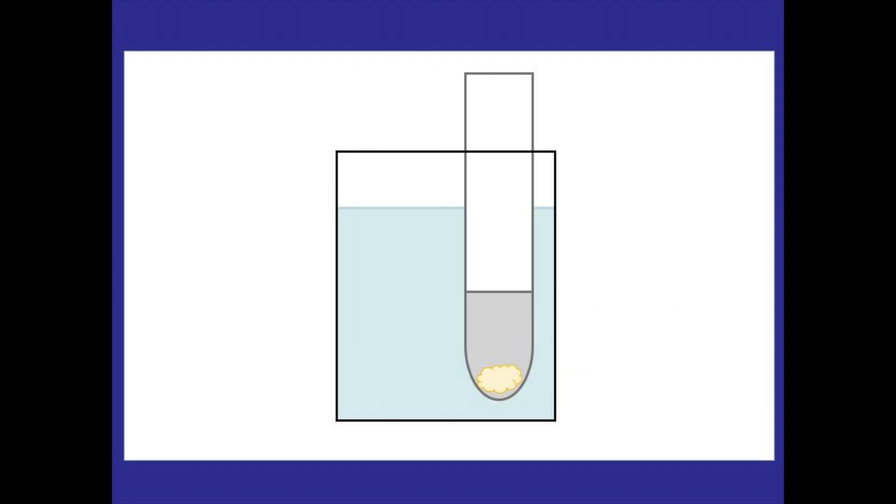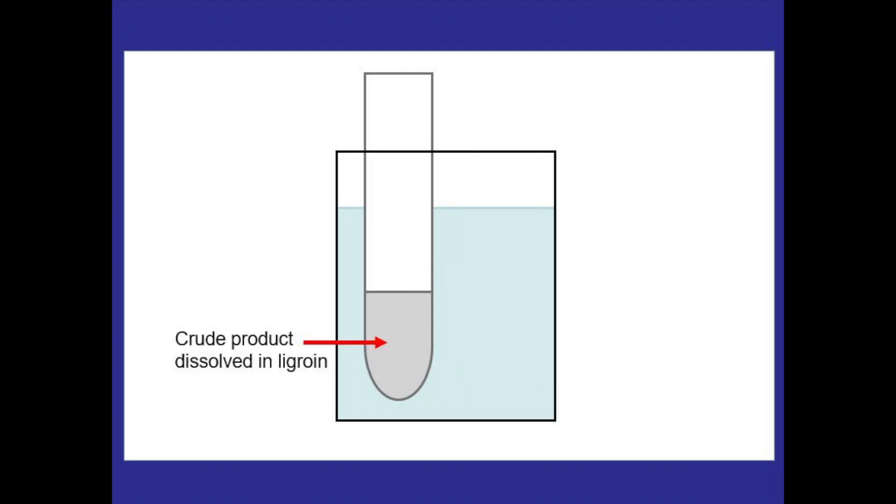From here we can take a piece of cotton and put it in the test tube just on top of the contamination. Then using a Pasteur pipette, start transferring the ligroin solution into a new clean test tube. The cotton will prevent the contamination from moving with the solution into the pipette, leaving the crude product dissolved in ligroin by itself, and then we can continue the recrystallization process like normal from here. Now all of this should be done in a hot water bath to ensure that the crude product remains dissolved in that ligroin solution.